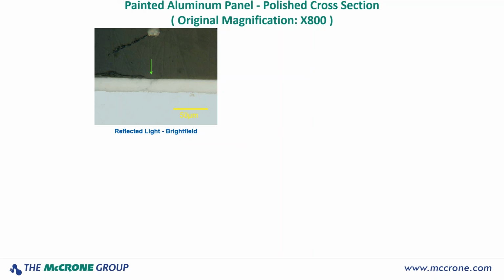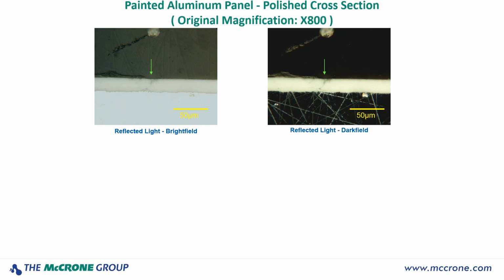Any liquid material that might be in contact with that paint surface can now migrate down through that crack and get to the aluminum underneath it and start corrosion mechanisms in place. So these are defects in paint that you definitely don't want to have.